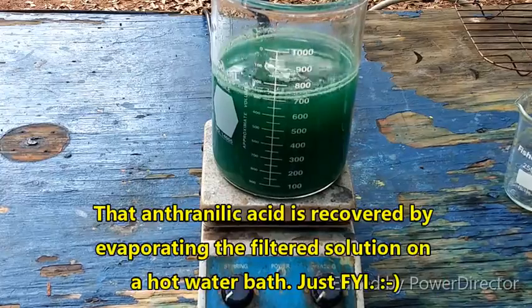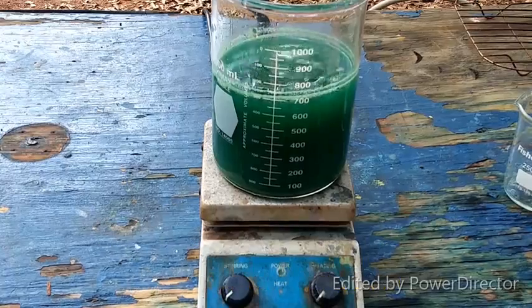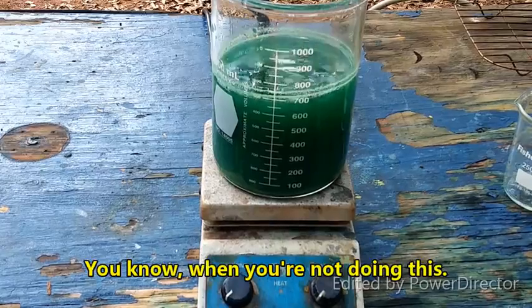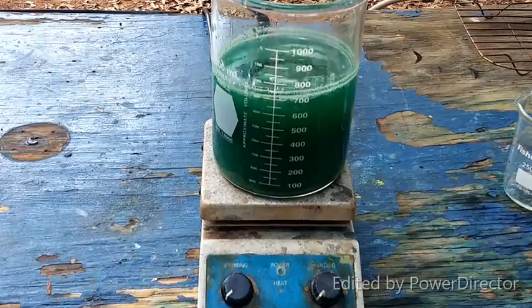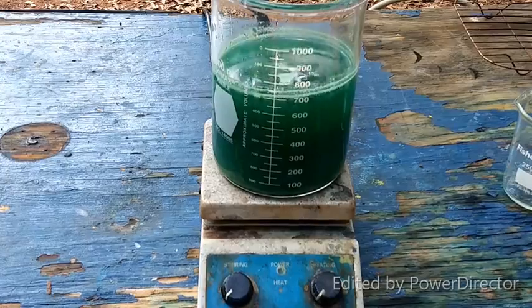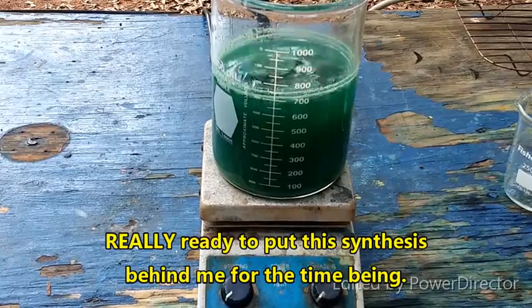It's all in the protocol on PrepChem if you're really gunning to get the most yield possible. As I made clear earlier, I don't really care about that. I just want to have enough to be able to do these other experiments, and that's all I really care about. But anyway, it is pretty convenient.